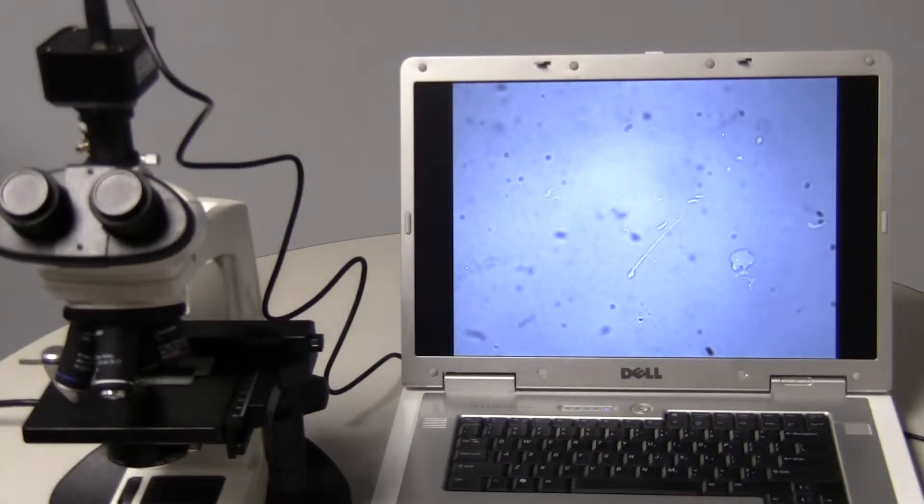This is a demonstration on how to locate the dirt that may build up in a microscope. There's several places the dirt can end up.